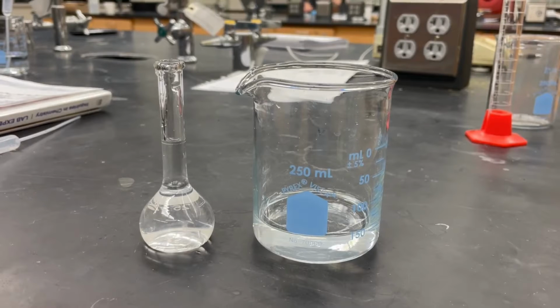On the left, you have a properly created dilution, and on the right, you can see the original stock solution. In case you were wondering, a stock solution is a previously prepared liquid that has a known concentration, and a dilution is the less concentrated liquid we will create from the stock solution in today's lab.